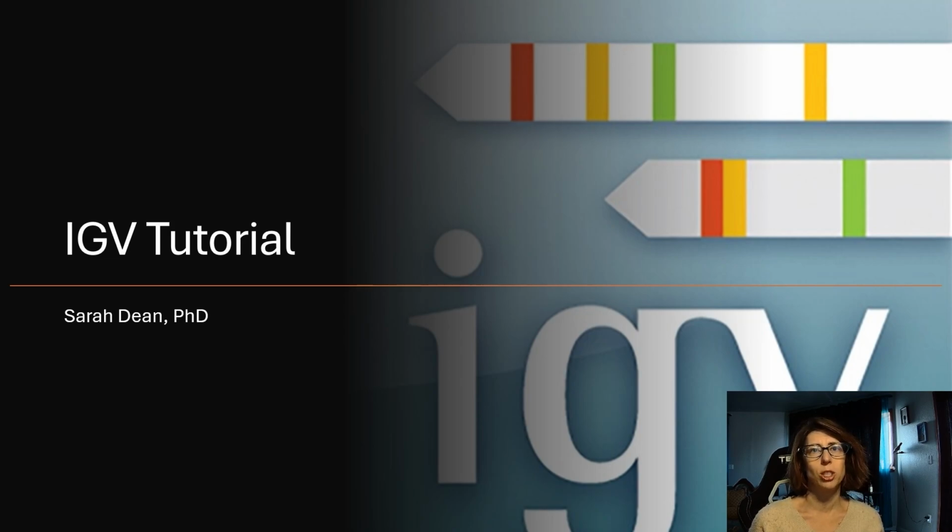Structural variants are mutations that disrupt larger chunks of DNA or the structure of a chromosome. They include gene fusions, translocations, inversions, internal tandem duplications, and very large insertions or deletions. I don't have examples of all of these types of structural variants, but I will go over how to look at all of them, and then we'll look at examples of a small subset.